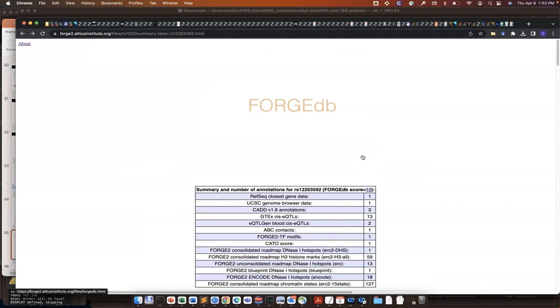Can the system predict the SNP on the virus, which is not human? Sorry, can you repeat? The SNP on the HPV16 virus is not human. Correct. Those kinds of SNPs don't have an RS number because they're not human. So a lot of SNPs don't have an RS number, which is kind of a problem. But we can.